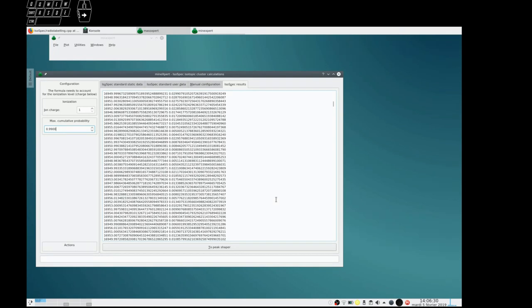So what we did here is we asked IsoSpec to compute all the various isotopic combinations that are possible up to 99% of the whole set of combinations that would occur practically in nature. And as you've seen, this computation has been very quick. Now, the fact that these are not mass peaks, but mass peak centroids, makes this kind of data unplottable. So it's not going to look like a mass spectrum.